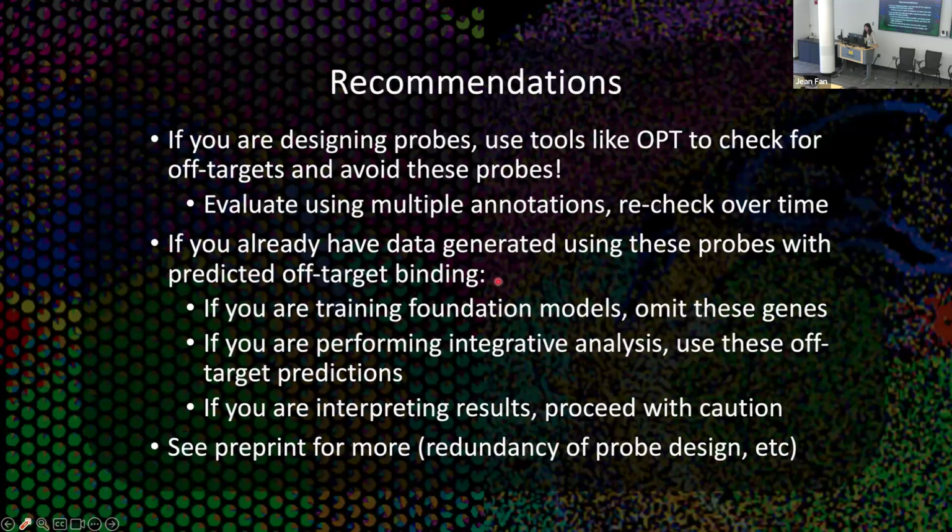But if you already have data generated using these probes, which we do, for us, if you're training foundation models, as we are trying to do also, I do encourage you to omit these genes to avoid error propagation. I'll just leave it at that.